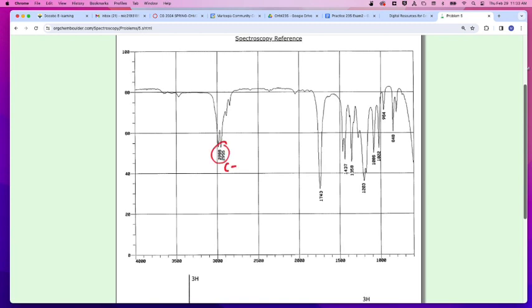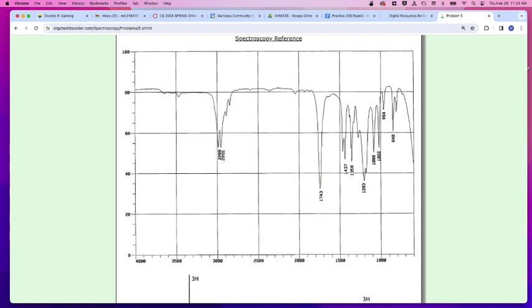We've got CH sp3s, not particularly exciting. 1743 seems a little bit high, but that's probably carbon double-bonded to oxygen. After that, there isn't a whole lot else for us to go through and see and visualize. And in looking at this, I want to go back to that formula real quickly.